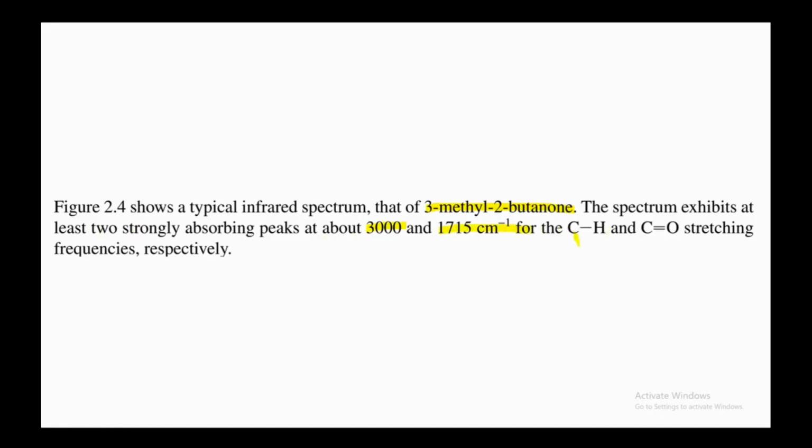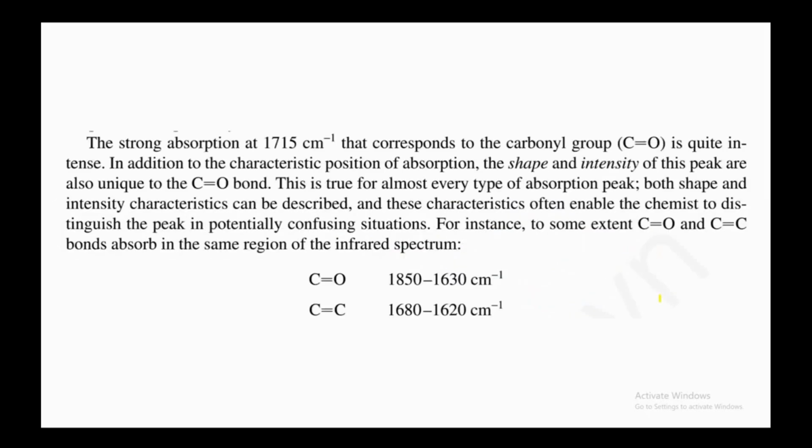This one is for CH, and this one is for the carbonyl group stretching frequencies respectively.